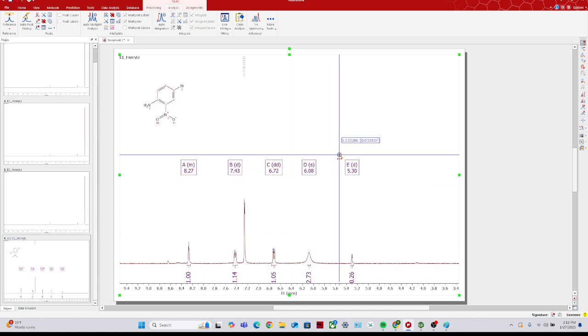In the case that you have an impurity, I would recommend using ChemDraw heavily, or also trying to find Googled spectra of the NMR and cross-reference your spectrum to see what the other impurities are. That probably comes from two things: unreacted starting material that has bled through from previous reactions, or it's a daughter impurity, meaning that one of the reactants in your original reaction, or one of the subsequent products in future reactions, has reacted with the stuff that you've done now and created something different. That could be an issue, and those can completely skew everything up.